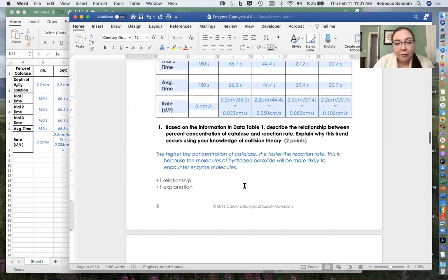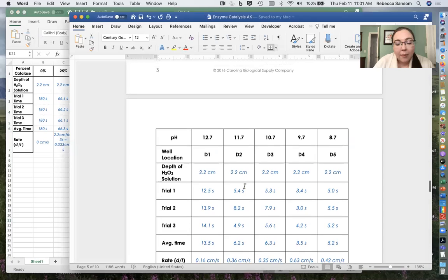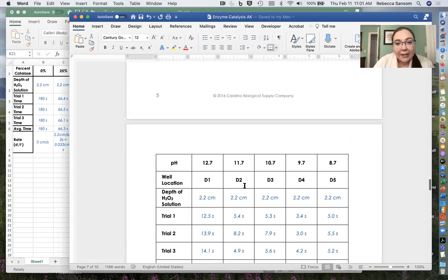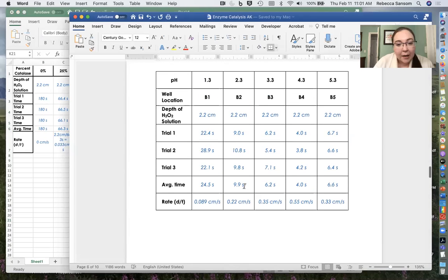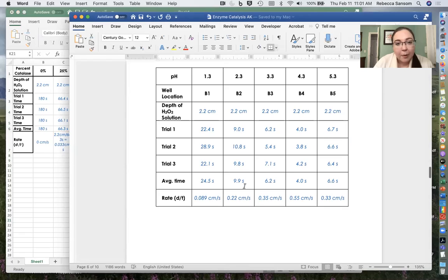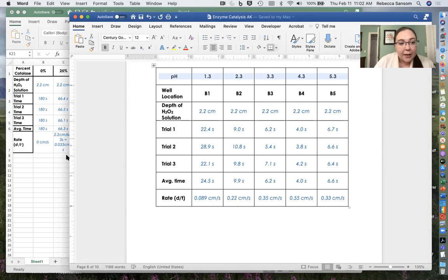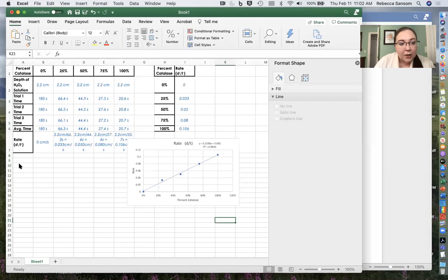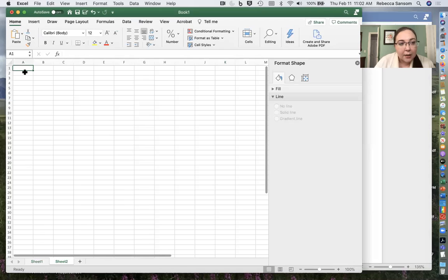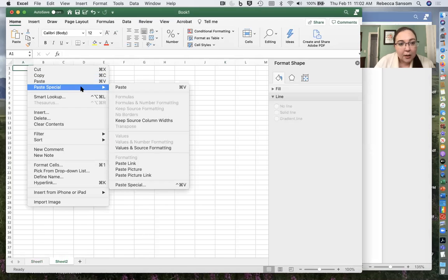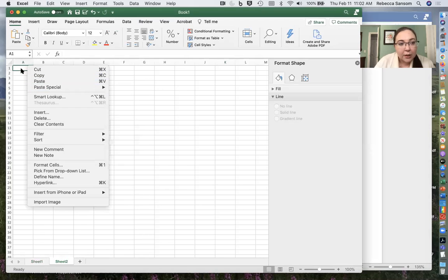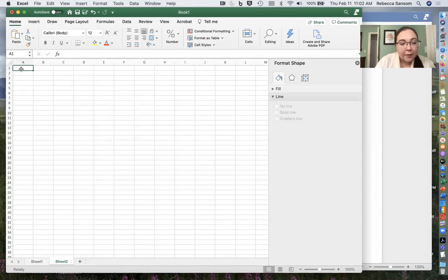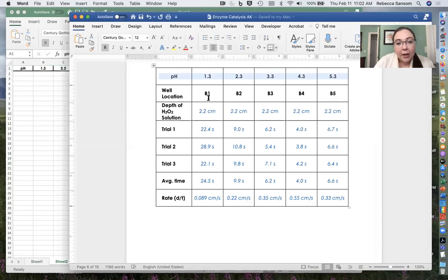Now for the acid and base, it's a little bit more complicated because there's like a little bit more data. So I'm going to copy over some of this data. I'll make a new sheet in Excel. We'll just paste it. That's fine. So we'll copy the pH and then I'm going to copy the rate.